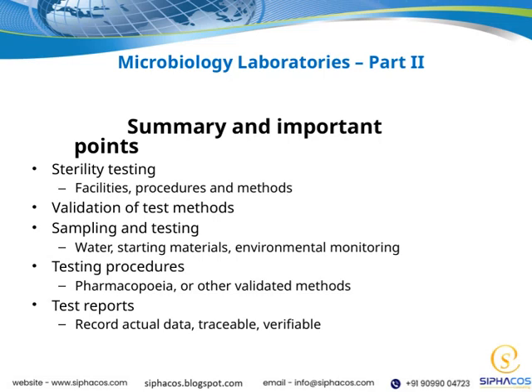Let's wrap up with a quick summary of the key points we've discussed. First, sterility testing is a critical component in ensuring that our products are free from microbial contamination. It involves careful consideration of facilities, procedures, and methods to maintain a sterile environment.